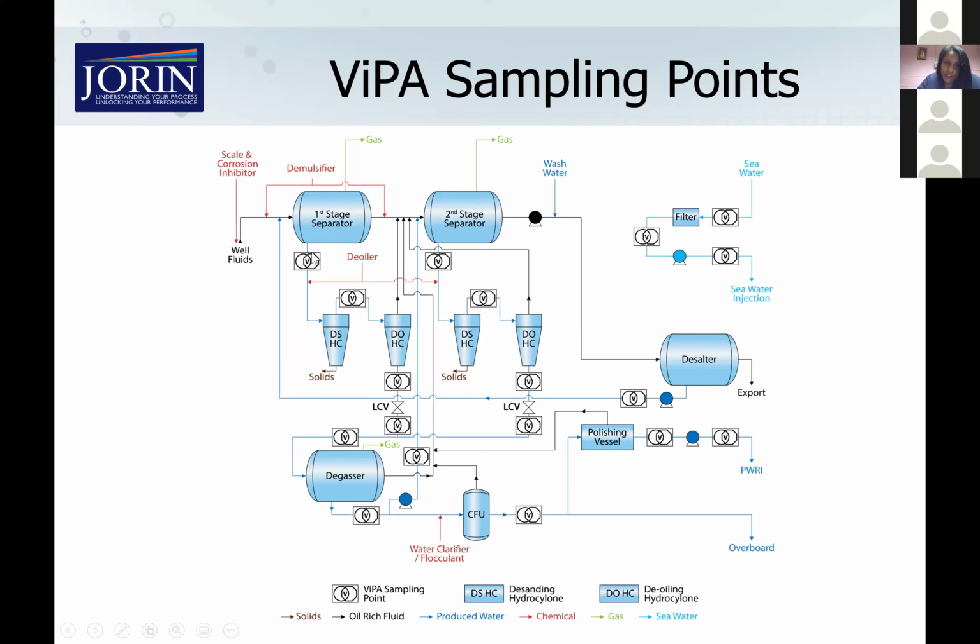And if you're monitoring it at that stage and making the changes that you need to the process at that stage, then the chances are you will never have out of spec water for your overboards and reinjections. Or if you did, it'd be very, very short amounts of time before you made all the changes that you need.